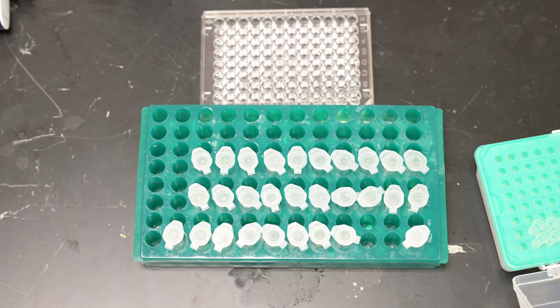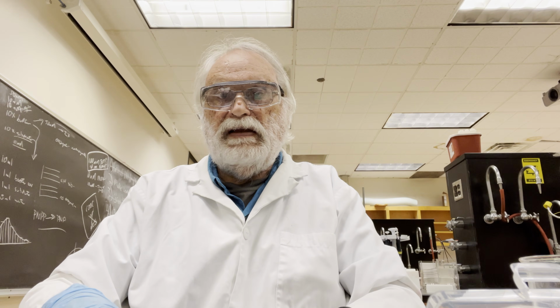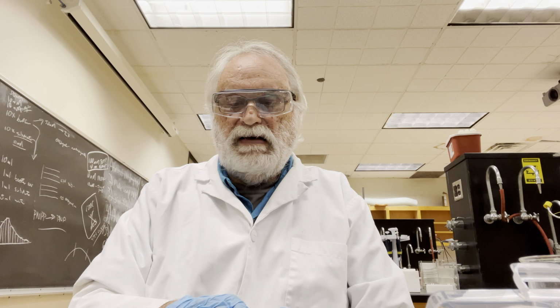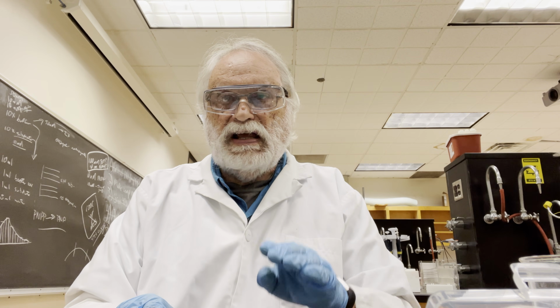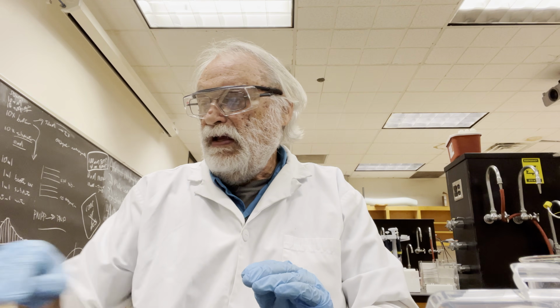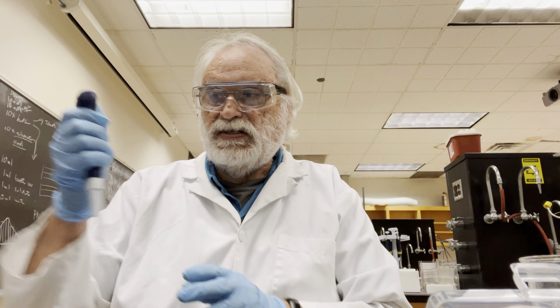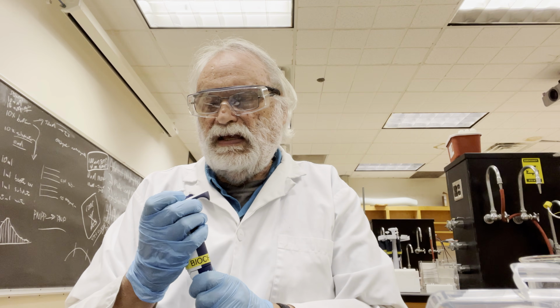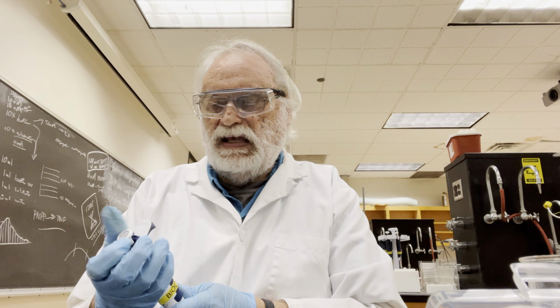So now I've loaded, now this plate has all the samples to be analyzed in them. So I have the lysate, the column fractions, and my standards all on the plate. The next step of the process, and you guys will hopefully be doing, is the BCA assay.